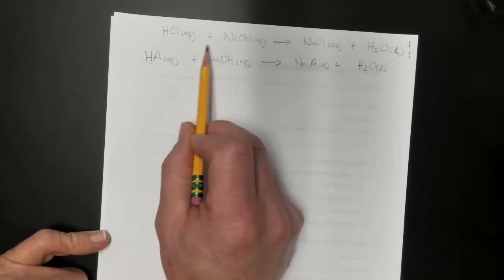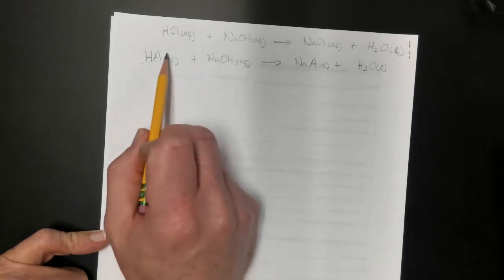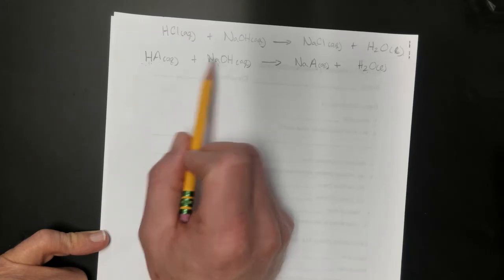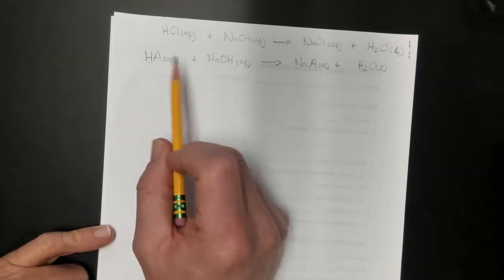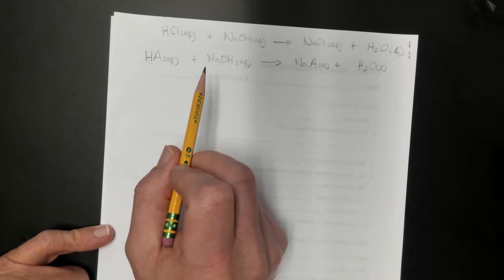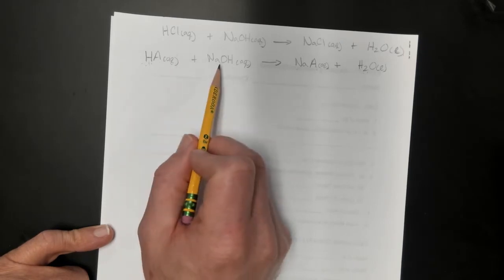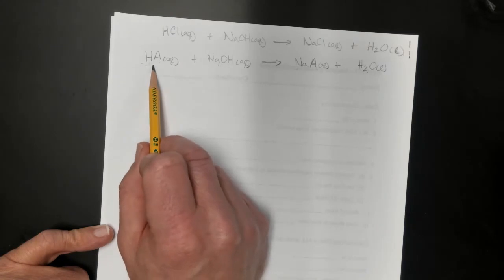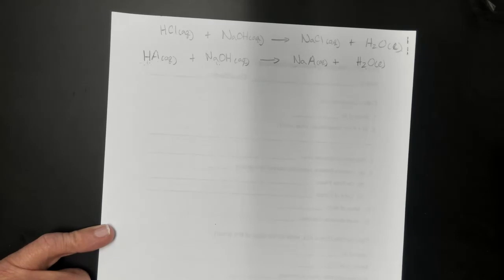So in this case, we're adding sodium hydroxide to this analyte over here. This is known as the titrant. This is the analyte, even though we're trying to determine what the concentration of sodium hydroxide is. At the endpoint, again, we know the number of moles of sodium hydroxide added at the endpoint is the same as the number of moles of potassium hydrogen phthalate we started with. So, do a quick calculation.